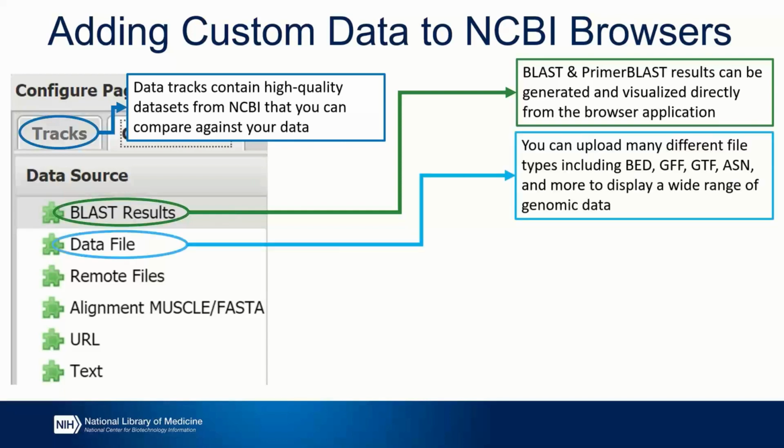Of course, we have the more traditional file upload option available as well. You can use this option to import any of the many different file formats that are supported by these viewers, including things like BED files, GFFs, ASN files, and more. And I'll talk about during the demonstration how to find what other supported file formats are available.